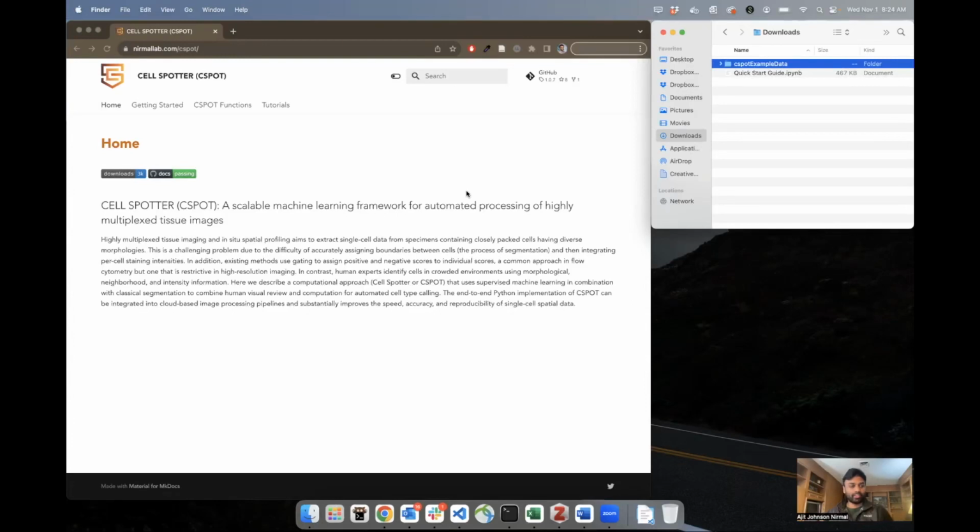Hello everyone. Today we are going to go through a very quick video on how to run CSPOT. In order to follow through this tutorial, all you need is two files. I hope you have this in hand right now.